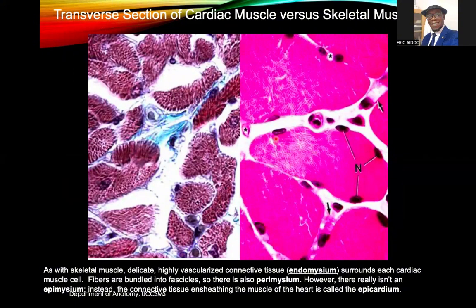To compare skeletal muscle with cardiac: that is a very clear skeletal muscle — one, two, three, four, five nuclei — and this muscle fiber is quite large compared to that of the cardiac muscle. The cardiac muscles also have a particular pattern of appearance; the appearance is not as smooth as that of skeletal muscles, and it usually has a single nucleus.